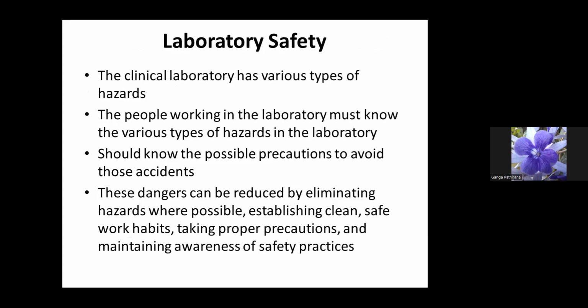So laboratory safety is important. Why? The clinical laboratory has various types of hazards. The people working in the laboratory must know the various types of hazards in the laboratory and should know the possible precautions to avoid those accidents. And these dangers can be reduced by eliminating hazards where possible, establishing clean, safe work habits, taking proper precautions, and maintaining awareness of safety practices.